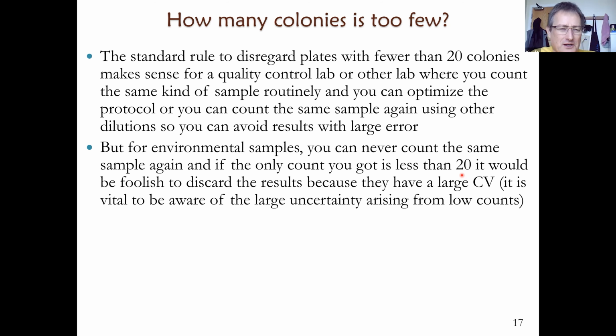But please, if you're not sure what significant figures are, it's good to know about that. If you're comparing the results with the other procedure, the mean in this case is the same, not necessarily, but in this case, the error is higher than from the other method. Again, that depends.